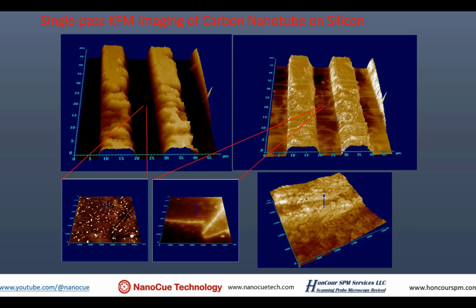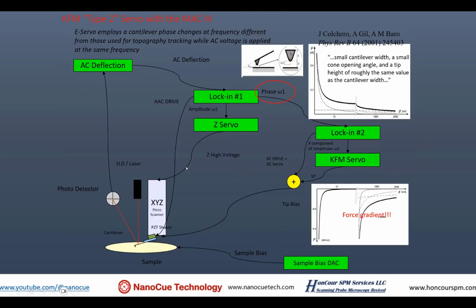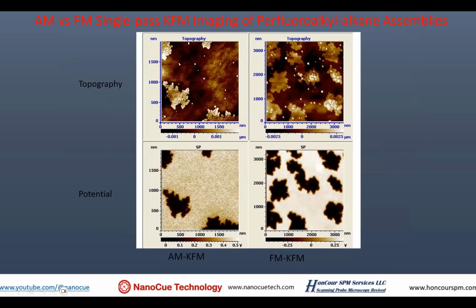On the subject of substrates, those fluoroalkane materials: the potential displayed is caused by the dipole moment within the fluoroalkane molecule, because one end of the chain is hydrogen terminated carbon, and the other end of the chain is fluorine terminated carbon.